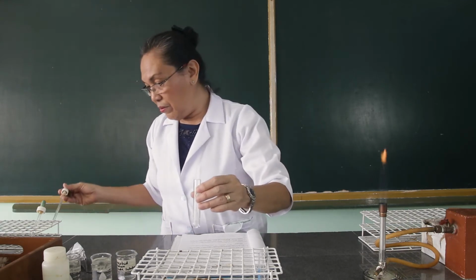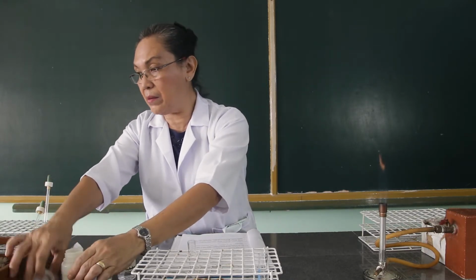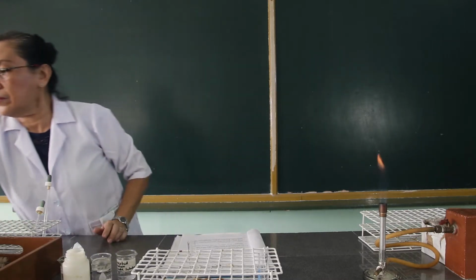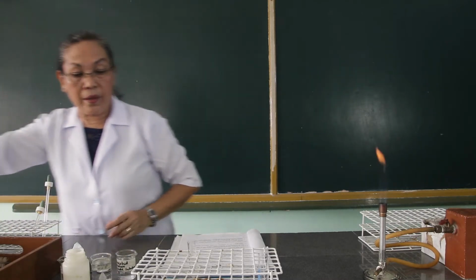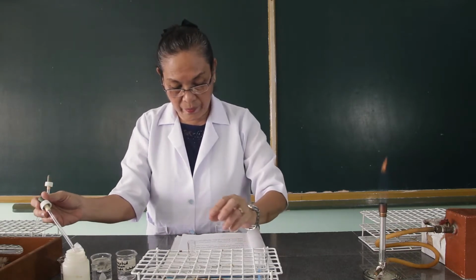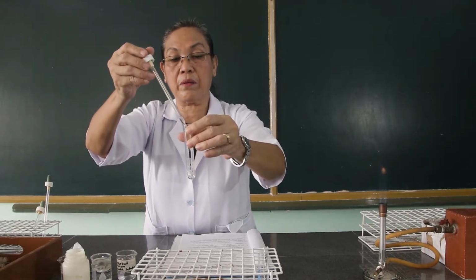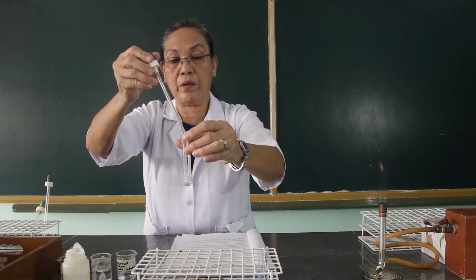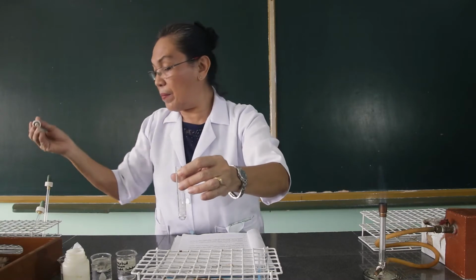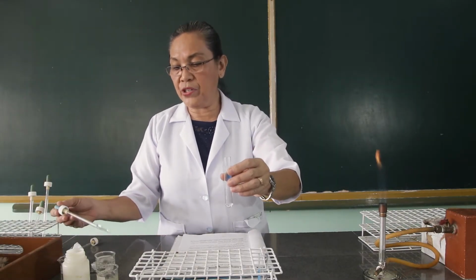This is ammonium chloride. Then let's add ammonium hydroxide. Then add 1 ml of the magnesium chloride.